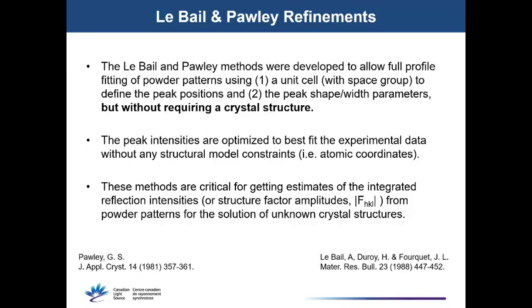So the Lebail and Pawley methods were devised specifically to facilitate this full pattern refinement without the need for a crystal structure. So they do require a unit cell, but you don't necessarily even have to know the correct space group. For an unknown structure, you can test a few different space groups and see which space group option or which setting of that space group actually works the best. So both of these methods fit the peak intensities to best fit the experimental data. So you can use them to extract an estimate of the peak intensities, which is often an important precursor step to doing your structure solution.